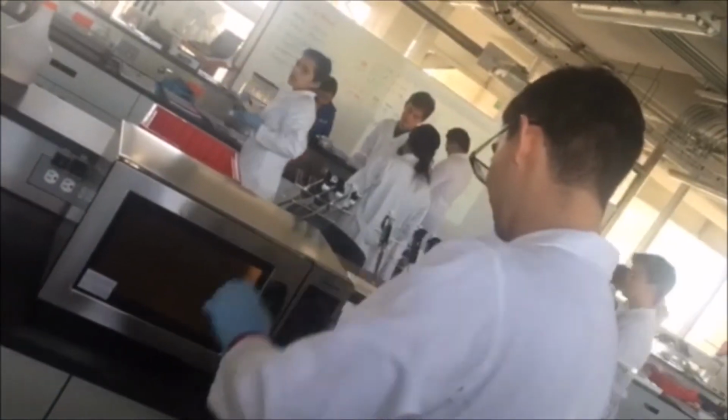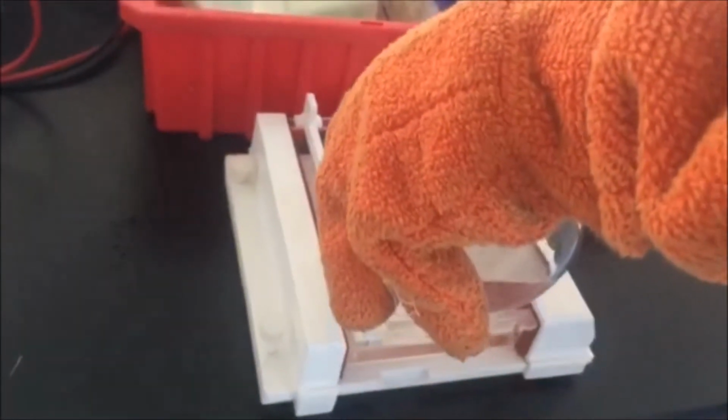95 ml of distilled water. Beforehand, the electrophoresis chamber where the gel is to be set has been prepared with its comb. Calculations were also made to determine the amount of SYBR Safe that is to be added to the gel, which has to be dissolved in a microwave, taking precaution that it is not overheated.